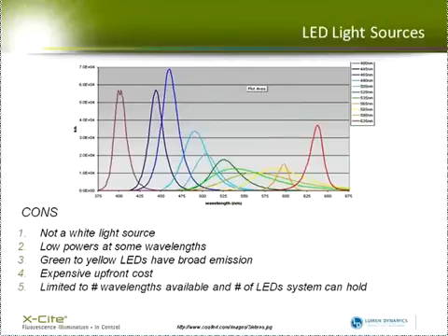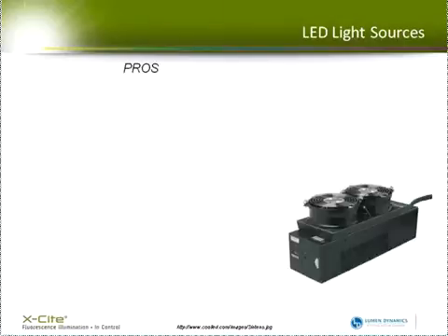It depends on the architecture. The different companies are selling these kinds of systems, and some of them are limited by the number of wavelengths. You can only pick 3 or 4. So if you're in a lab that's using the same 3 or 4 dyes all the time, it may be fine. But if you're in a core facility or something like that and you want to have a lot of flexibility, sometimes that can be a bit of a limiting factor.